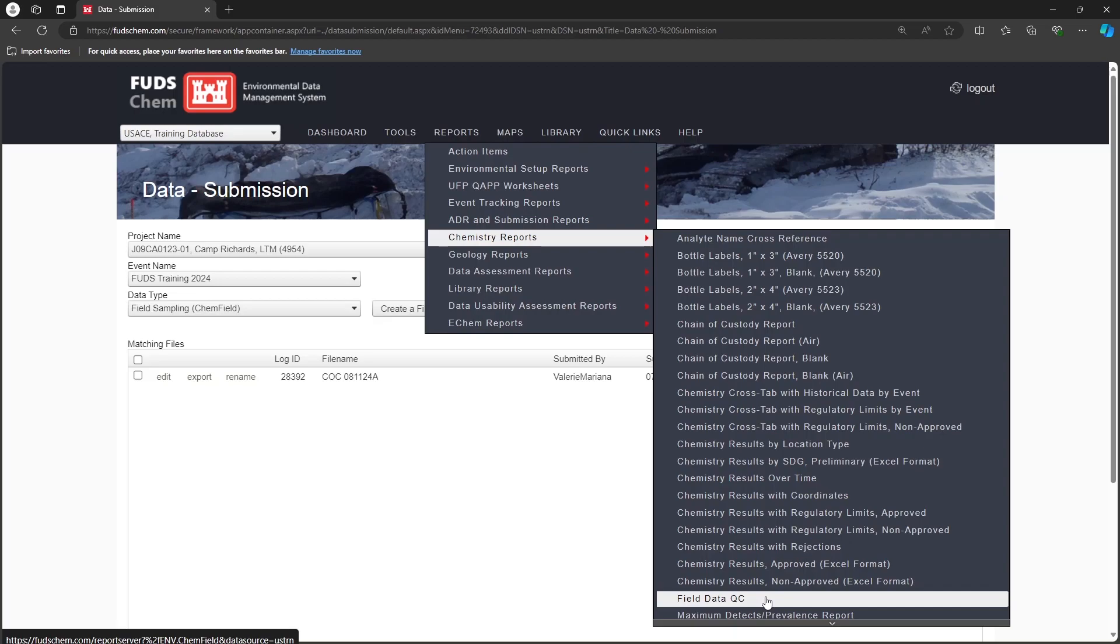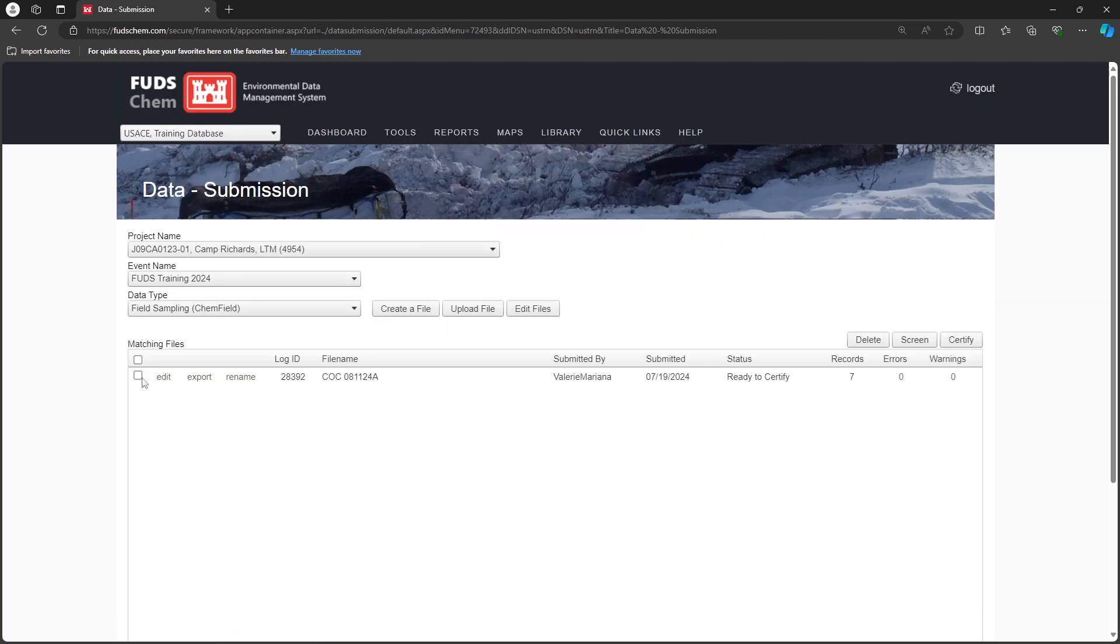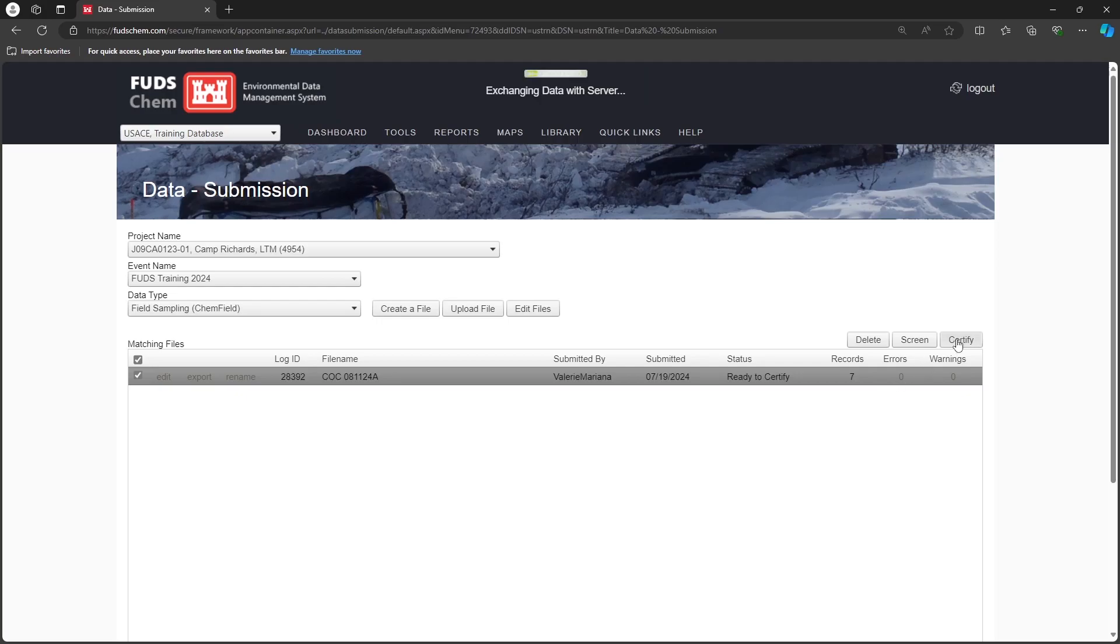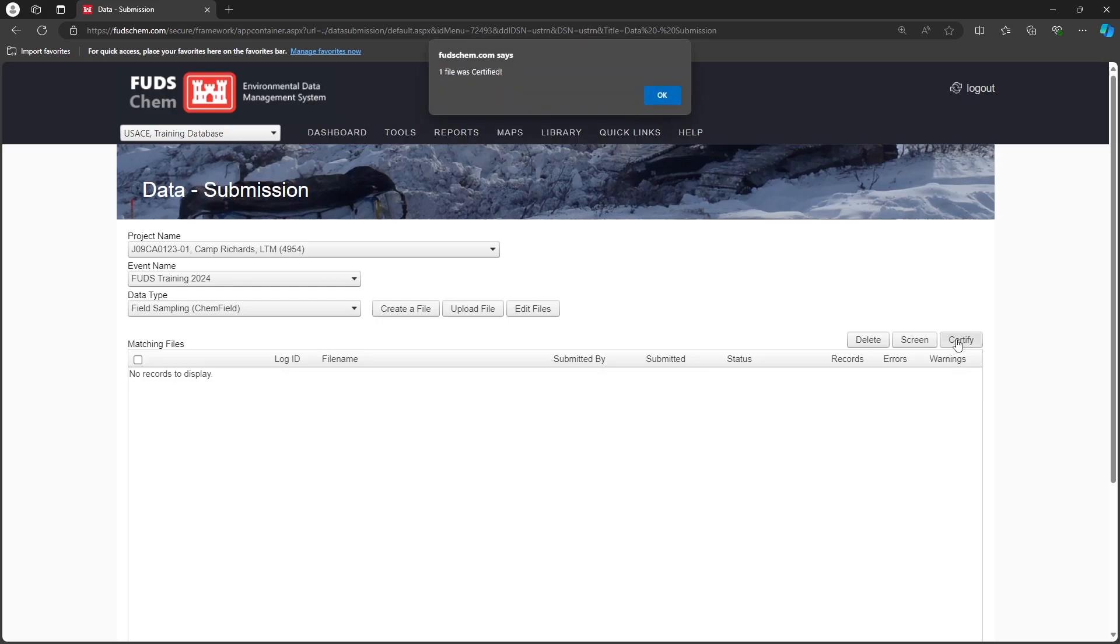Once the file is complete and error-free, select it in the interface and click Certify. Now the lab can load their data for these samples and methods. Be sure to submit ChemField files for any additional CoCs you may have.